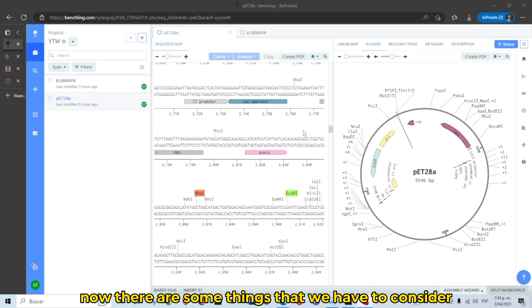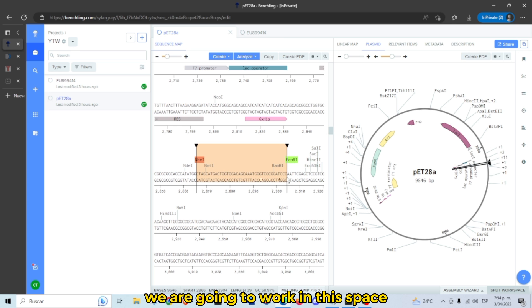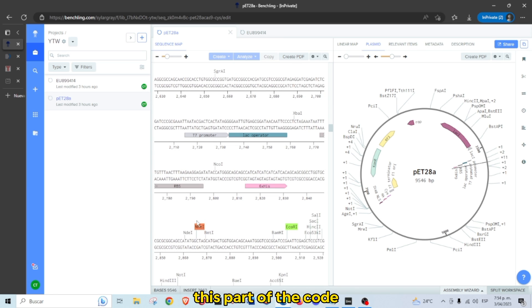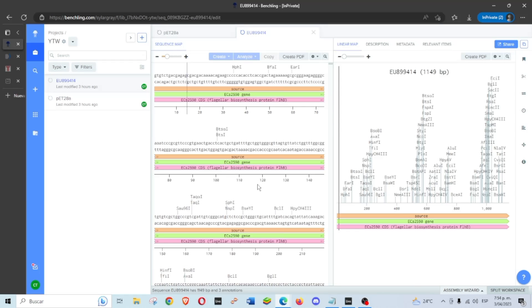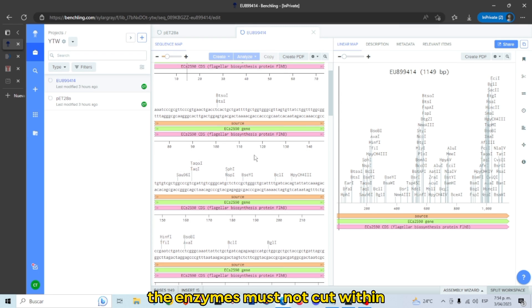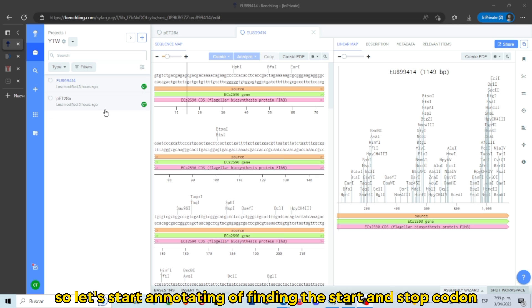Now there are some things to consider. We are going to work in this space — this part of the sequence — and it must be downstream of the T7 promoter, the lac operator, and the His-tag. We don't want to work over important elements. Also, the enzymes must not cut within the region of the gene, so we don't want our gene cut in half.